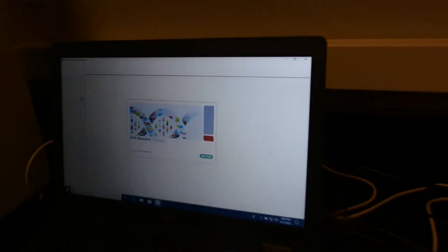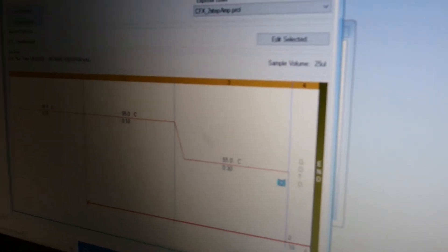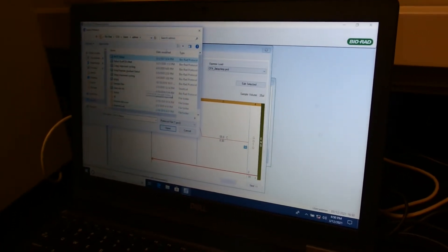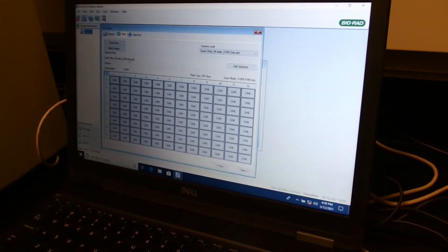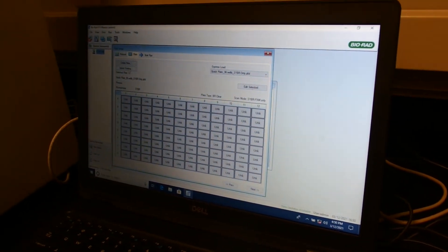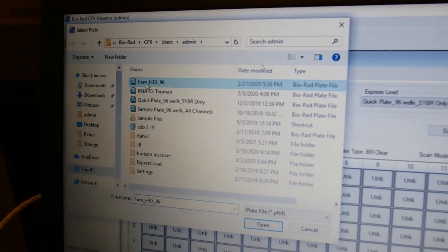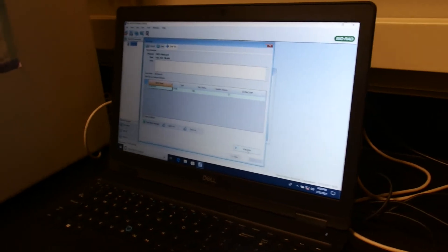That's really cool. Then we start the BioRad CFX Maestro. I'm going to click user defined and say select existing. In this case we're doing a PACE assay which is a specific genotype assay, and it's PACE Rubble and it has all the right stuff set in it. I'm going to click next and then select the plate. First we selected the protocol, now we select the plate. Say select existing and I'm going to only look at FAM and HEX. This assay we're only looking at FAM and HEX. Say open and say next and then I'm going to say start run.